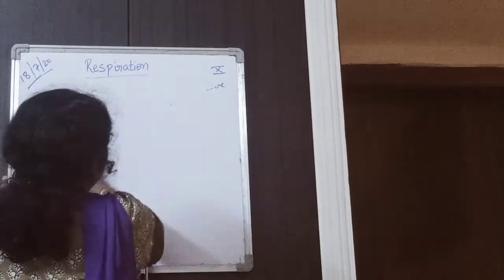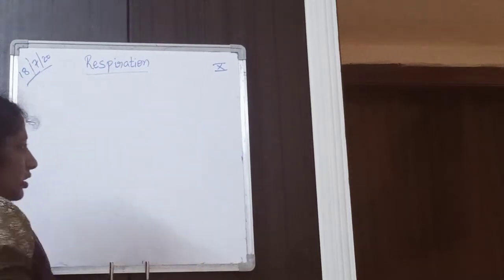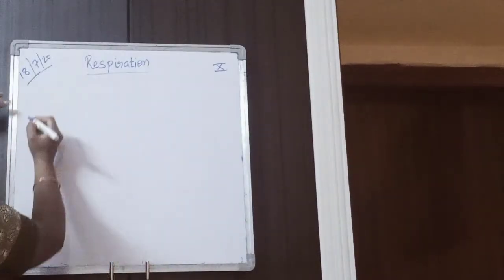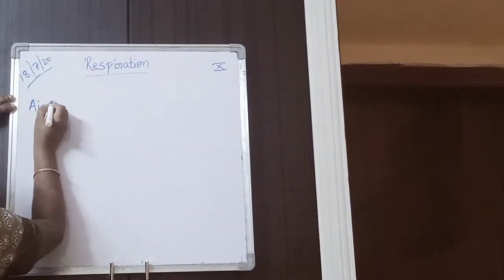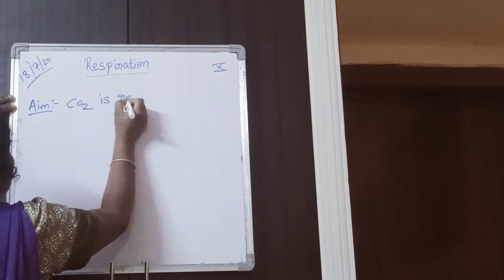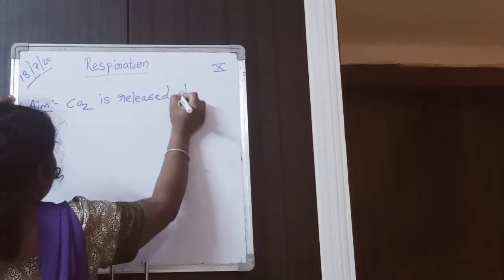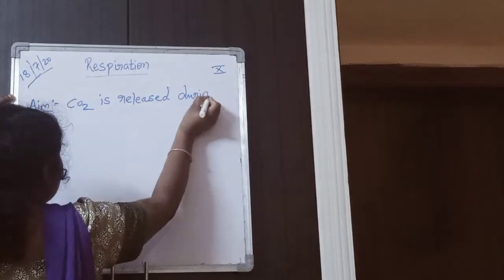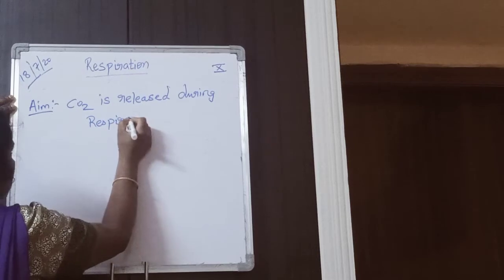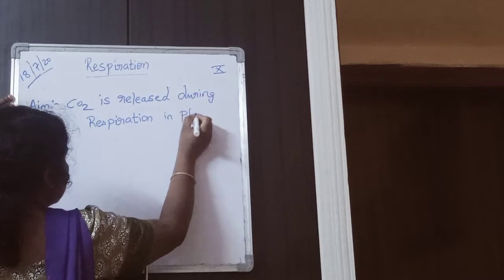What is the aim of the experiment? Carbon dioxide is released during respiration in plants.